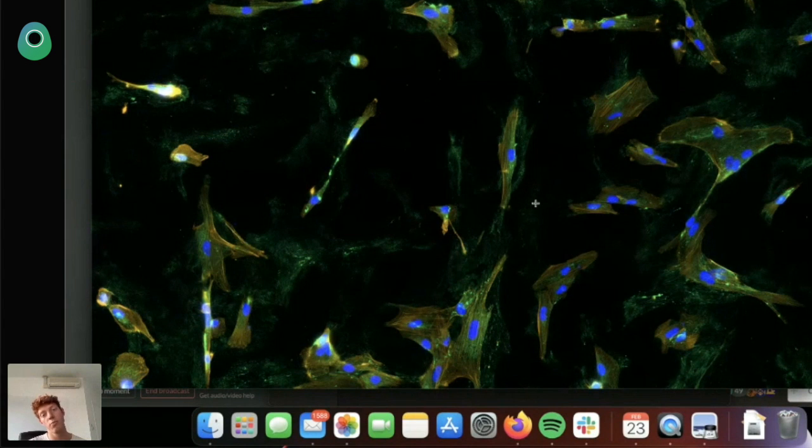And when they shared this use case with me, I immediately thought that AI, and most particularly computer vision, could really help detect those cell nuclei and automate the cell counting process, which would bring the nearly 10 hours process to something like 2 to 3 minutes for 1,000 images.